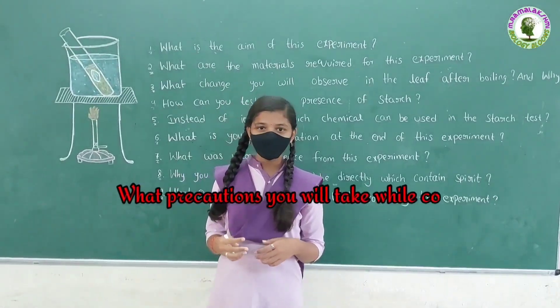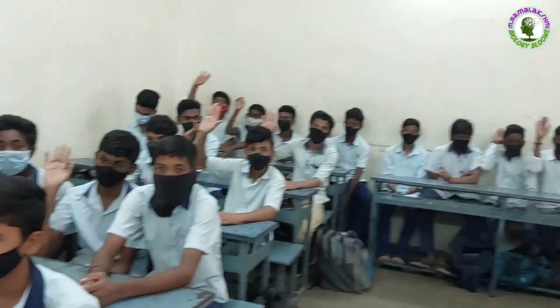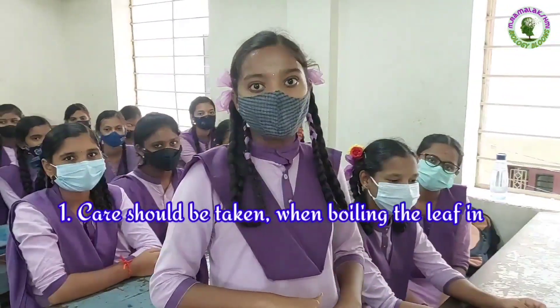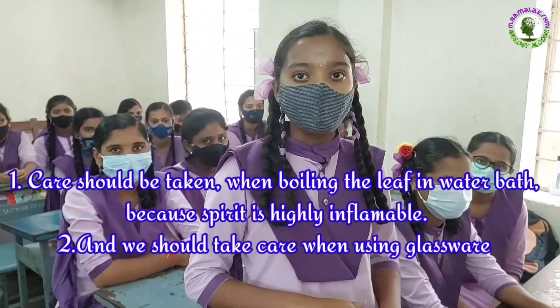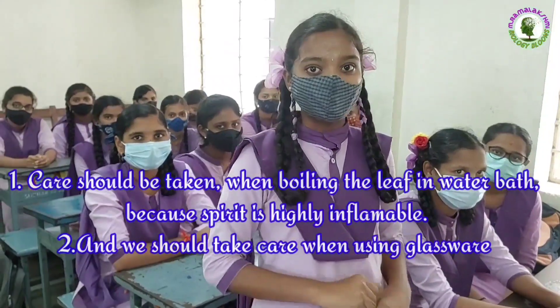What precautions will you take while conducting this experiment? Ganeshwari: Care should be taken when boiling the leaf in a water bath, because spirit is highly inflammable, and we should take care when using glassware.